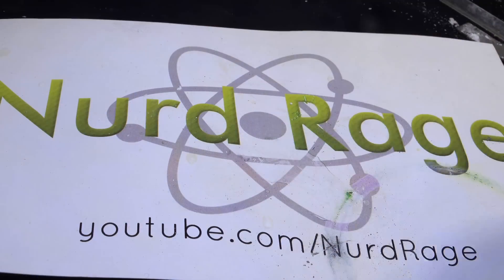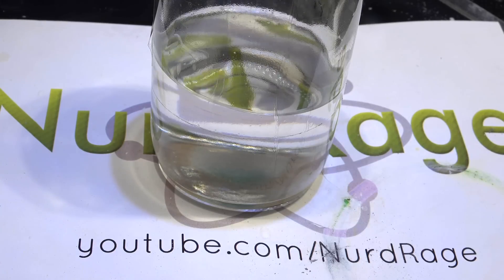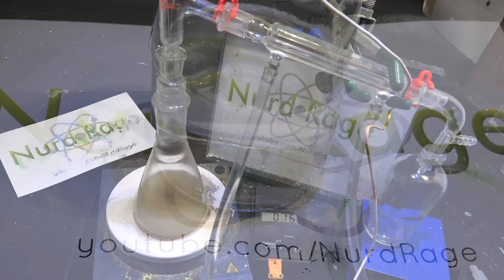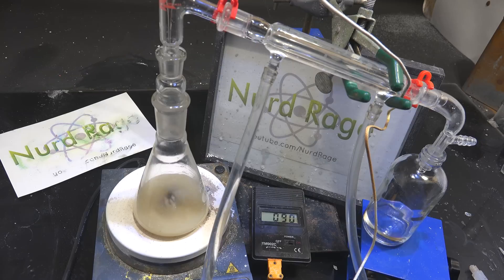Nonetheless, I think it's a good demonstration of some of the techniques and theory, in case you have similar chemicals you might want to purify. At first glance, the obvious method to purify a liquid like triethylamine is to distill it. This is indeed a good idea, but impurities like water or alcohol would also carry over, so we'll need to destroy them first or render them non-volatile so they don't distill.